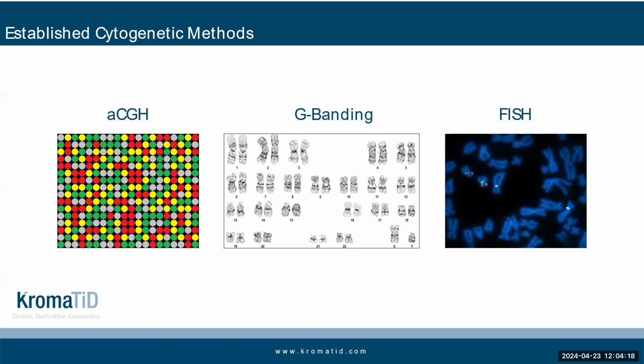Lastly, fluorescence in situ hybridization, FISH, is a hybridization-based assay like microarray, but is almost always run on whole single cells. Fluorescently labeled probes bind to complementary sequences on sample nucleotide molecules, permitting strategic multiplex designs for targeting specific loci or entire chromosomes.